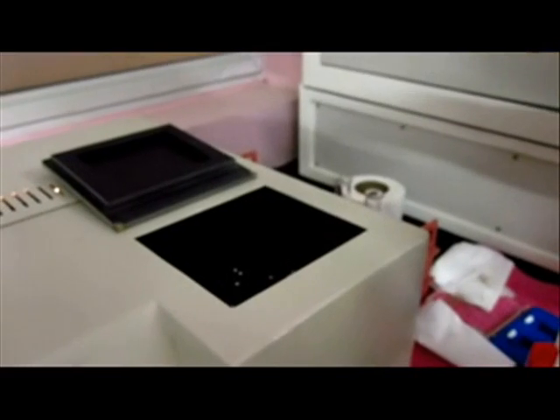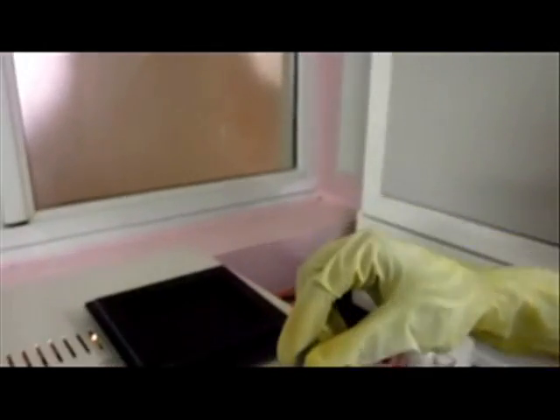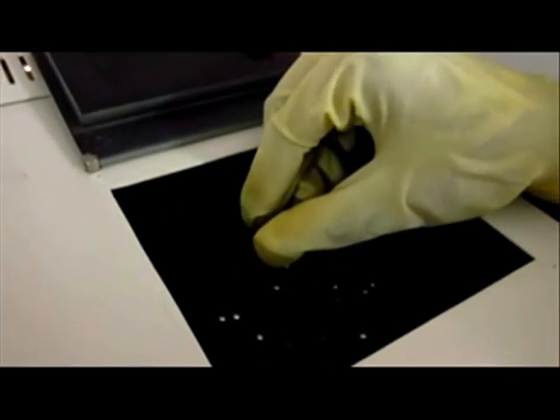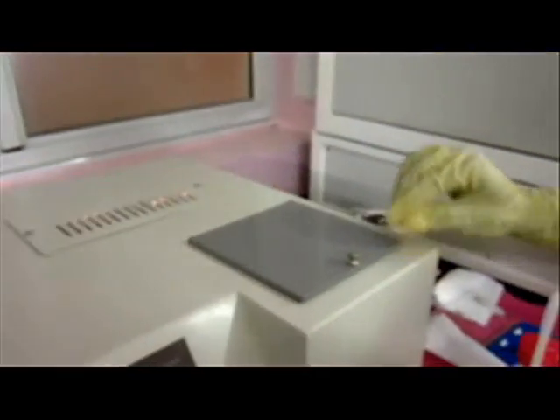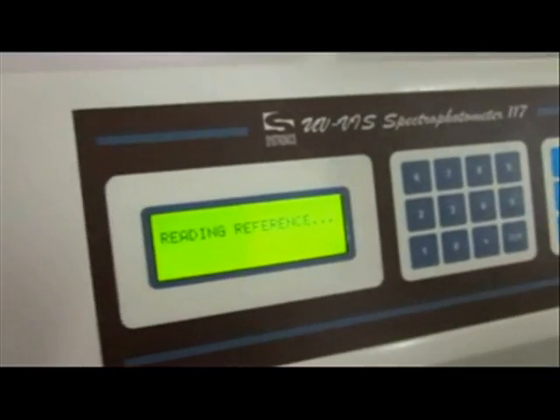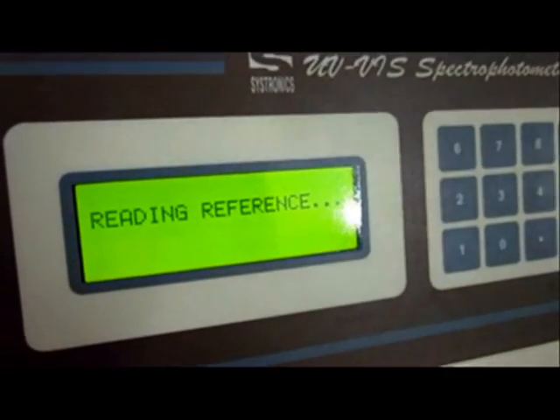Take the blank solution in your cuvette and insert it by handling the rough surface. Insert your cuvette which is having blank solution. Take it as reference and take reading, it will be zero.